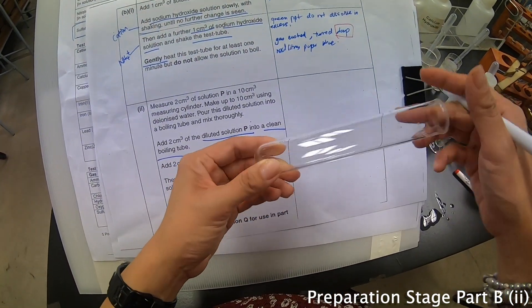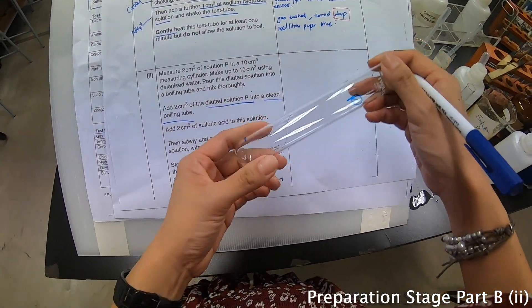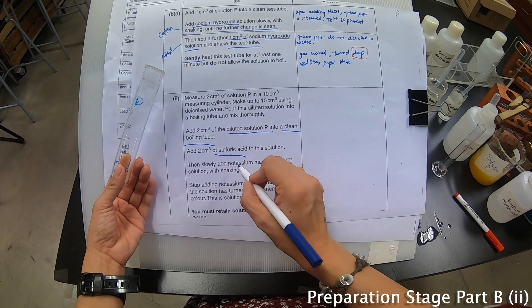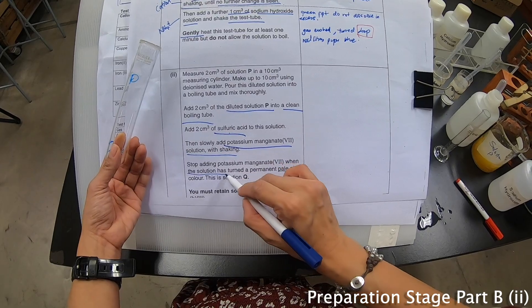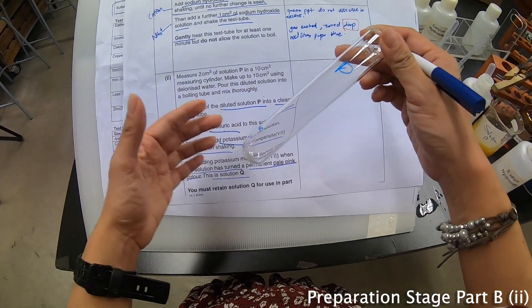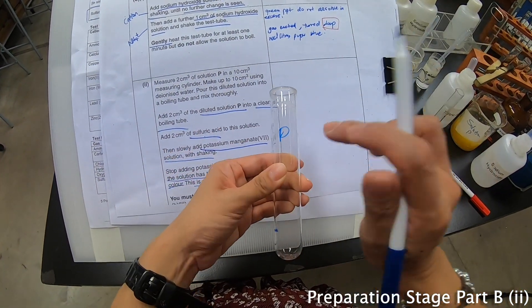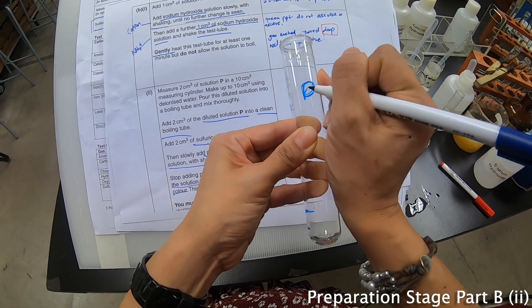You take out 2 cm³ of the diluted solution into a boiling tube — the boiling tube is the bigger one — and then add another 2 cm³ of sulfuric acid. Then we will add potassium manganate with shaking, and they say it will turn a permanent pink colour, and we call this solution Q. So after adding all this, what was P will now become Q.